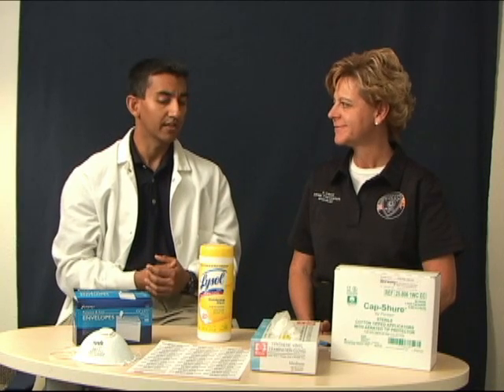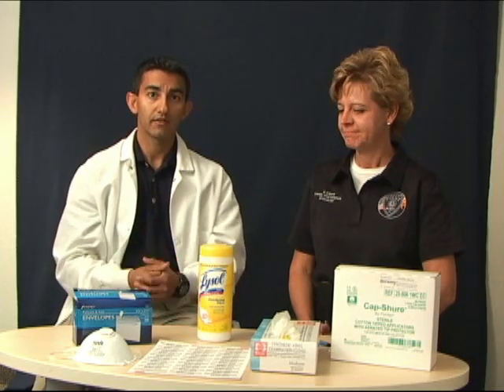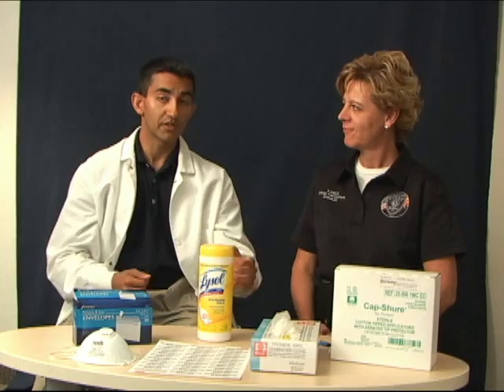Again, contaminating it. You want labels to label the envelope. So again, that's for labeling of the envelope. Synthetic vinyl gloves, not latex gloves.